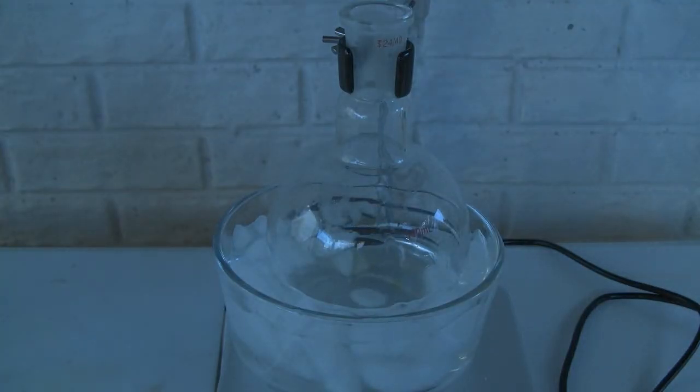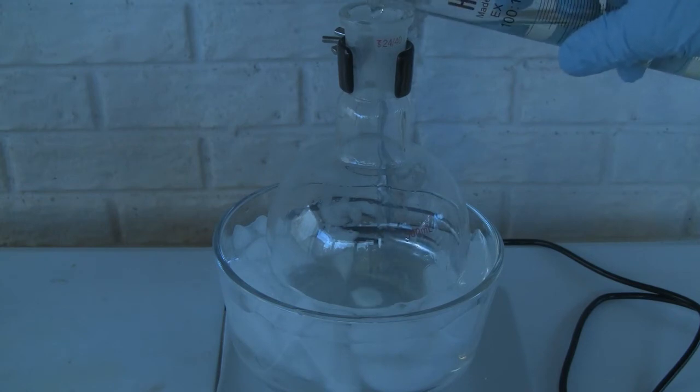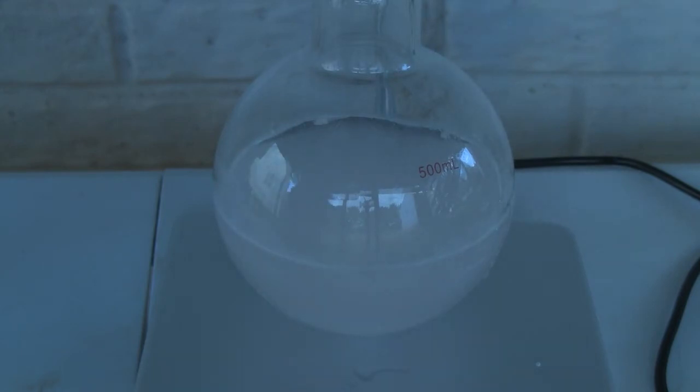Next, the 7.5% bleach is slowly added in portions to prevent excess heat that can lead to chlorate formation. Once the bleach is fully added and the solution is chilled at about 5 degrees Celsius, all of the phthalimide is added at once and allowed to stir until fully dissolved.